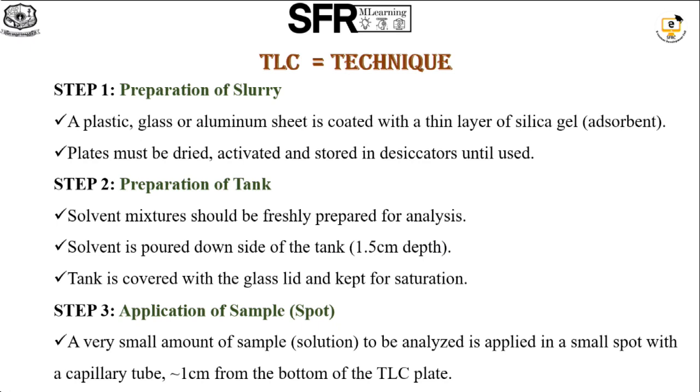The second step is preparation of the tank. The TLC tank is taken, cleaned and dried. The solvent mixture should be freshly prepared and poured down the side of the tank, to a maximum depth of 1.5 centimeters. The tank is covered with a glass lid and kept for saturation. The third step is application of the sample.